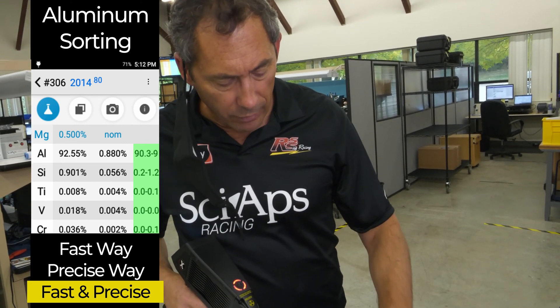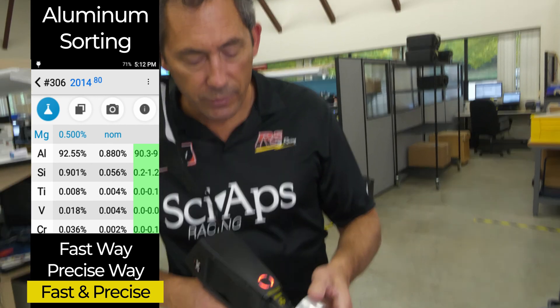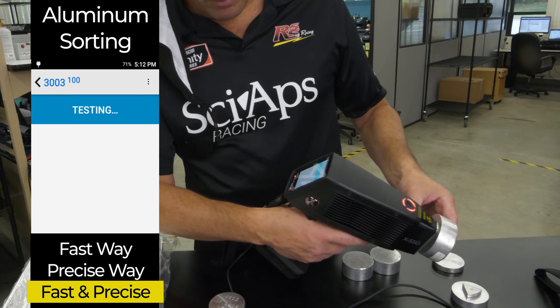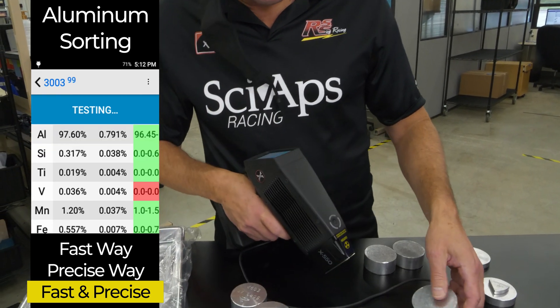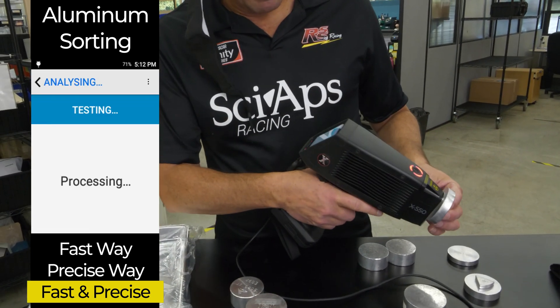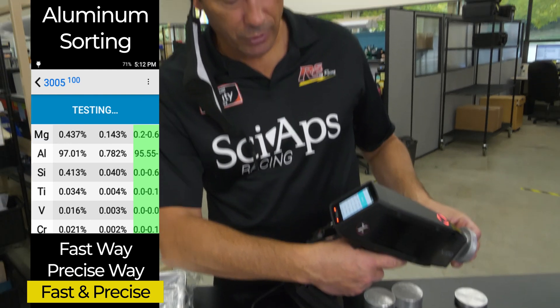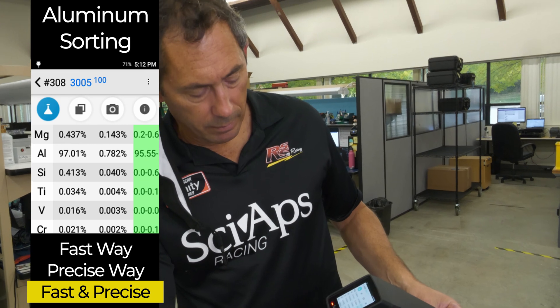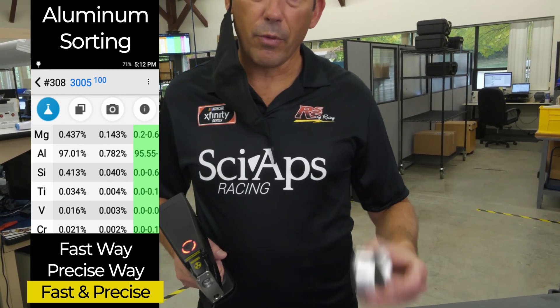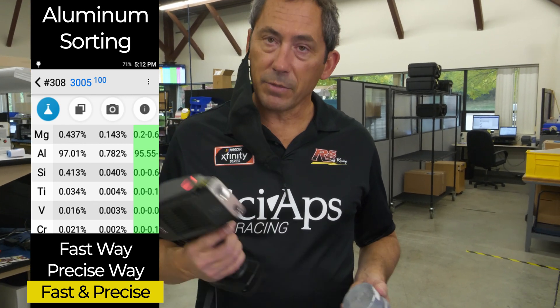Moving on — another classic example: 3003 is the typical alloy. You shoot that, 100%, one second — no magnesium to speak of. But what if you get a 3005, which has about 0.3 to 0.4% magnesium? This is a very fast way to do that. In about a couple of seconds, you get your 0.4% magnesium and you get your 3005. The only way to not mix up 0.3 and 0.5 is to test for the magnesium, and this gun has been designed to be really fast on magnesium.